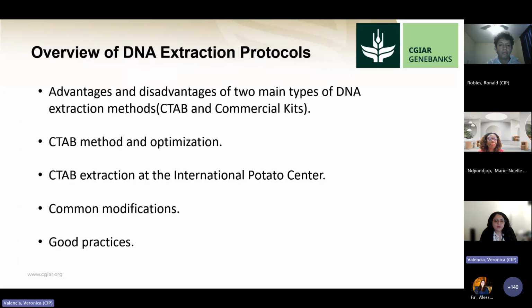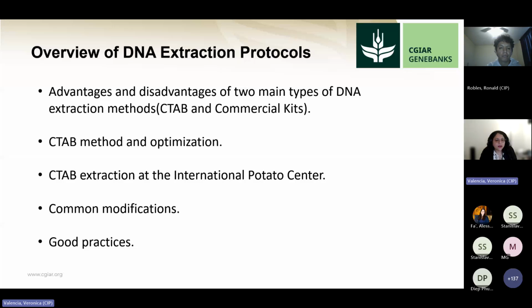So I'm going to talk here about an overview of DNA extraction protocols. I would start with advantages and disadvantages of two main types of DNA extraction methods, which are CTAB and commercial kits. And I would talk more deeply about the CTAB method and optimizations we've done here at CIP and other common modifications. And I would end with good practices.